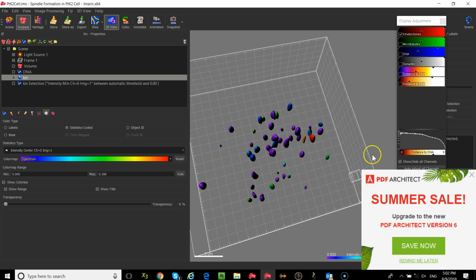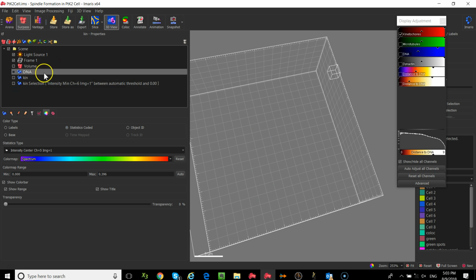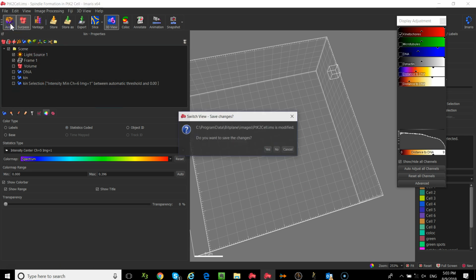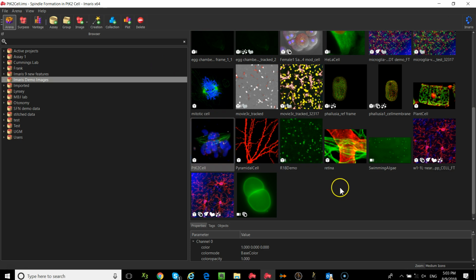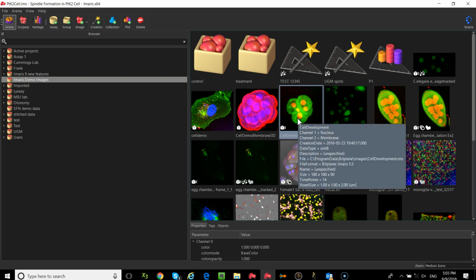Okay, so, PDFs, okay. I'm going to jump, because I want to give some time for specific questions. I'm now going to jump to look at the cell model, which incidentally does a lot of these distance measurements for you as part of its creation. But we're going to look at a few different things with the cell model. The image we're going to look at is the one labeled human embryo. Actually, it's not, but it is. It's called cell development, but it's actually a human embryo.